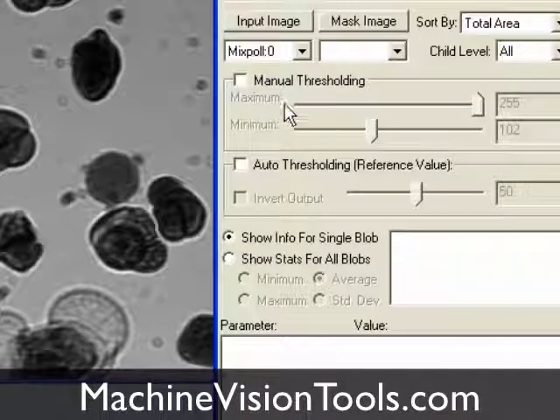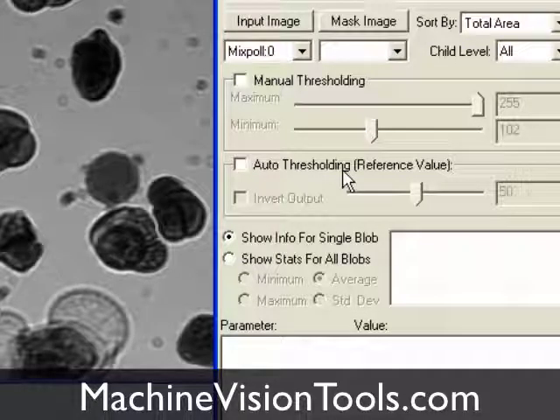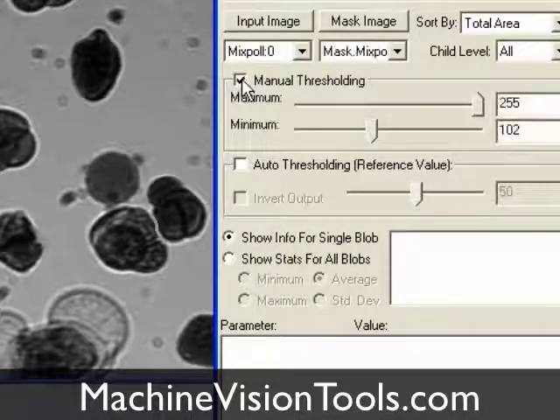With our options set, we'll decide how to create the mask image. We can perform automatic thresholding or, for more precise control, use manual thresholding, which is what we'll do.